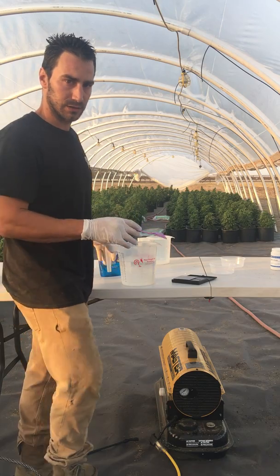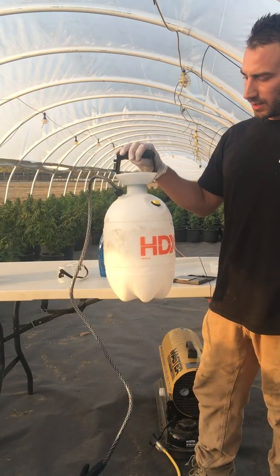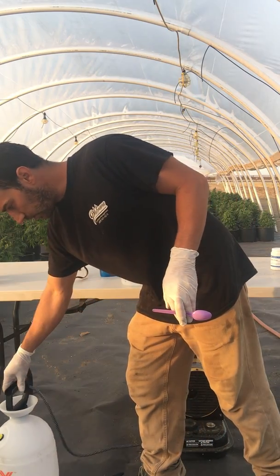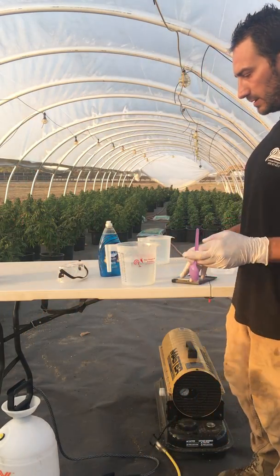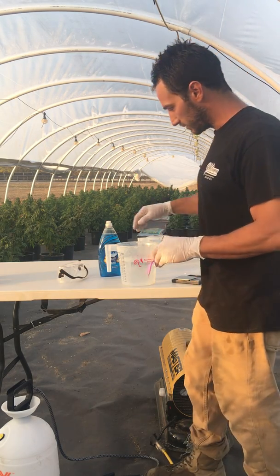My sprayer is right here. I've been told by my brother, who's a chemist, that the order in which you put them in and mix them together is just as important as doing everything else correctly.